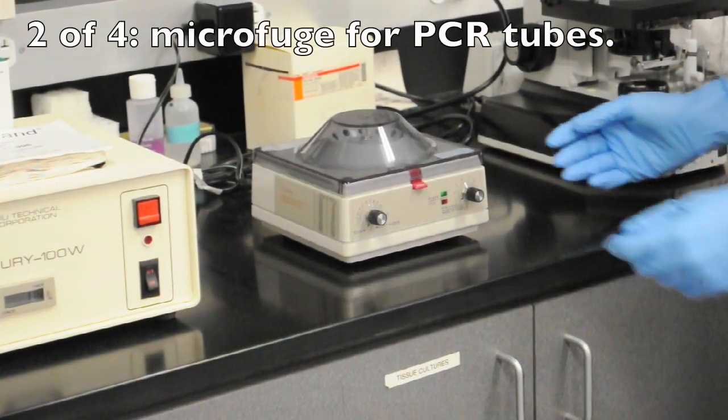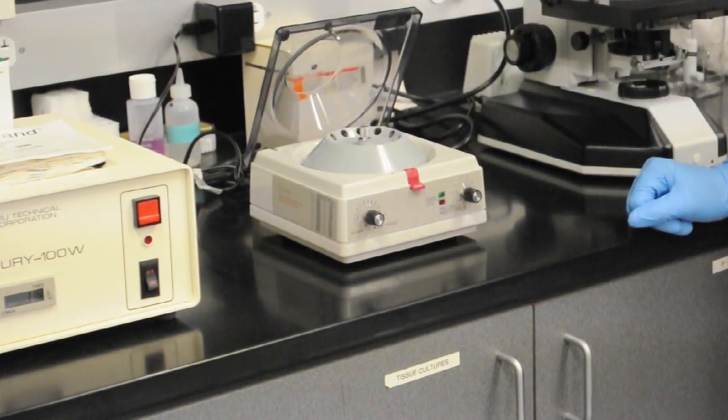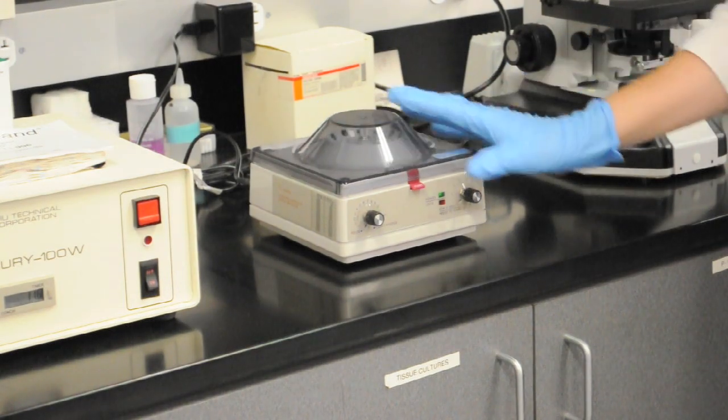Here's a smaller version of that same tabletop centrifuge. This one is for doing much smaller tubes. We would use this for polymerase chain reaction techniques.